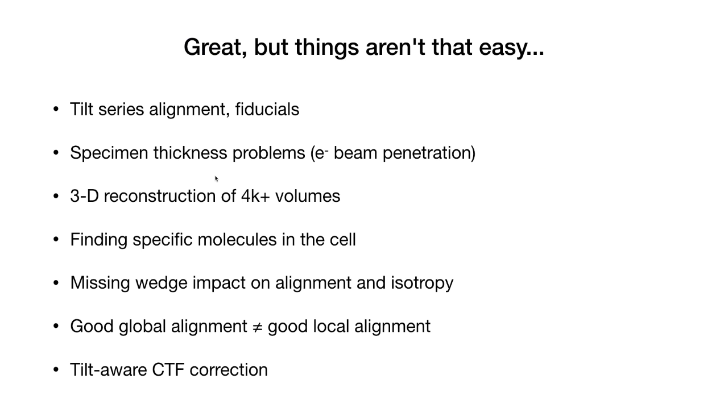The next thing you have to deal with is the fact that the volumes that you're trying to reconstruct are 4K by 4K by 1K, for example, pixels. They're quite large. When you do single particle reconstructions, it's considered big when you're doing a 1,000 by 1,000 by 1,000 volume, say, of a virus particle at very high resolution. These volumes are just humongous in comparison. And if you look at reconstructions people try to do now with the new large format detectors, people may try to do a 10K by 10K by 4K reconstruction of something. It requires tremendous amounts of memory, and there are all sorts of issues involved with that.